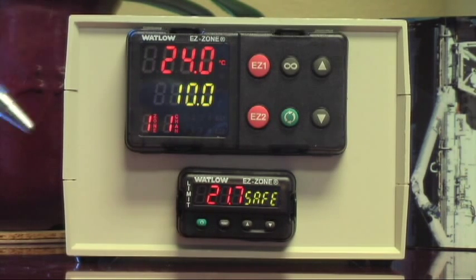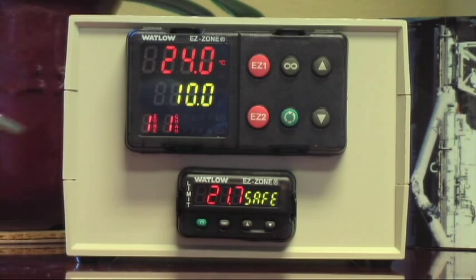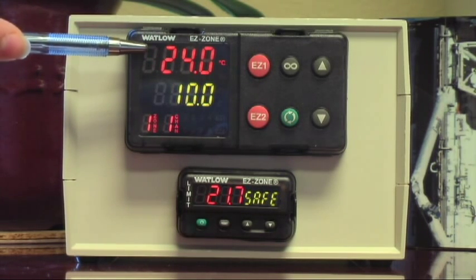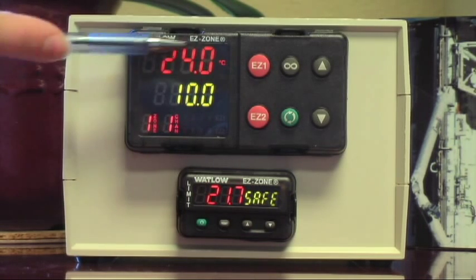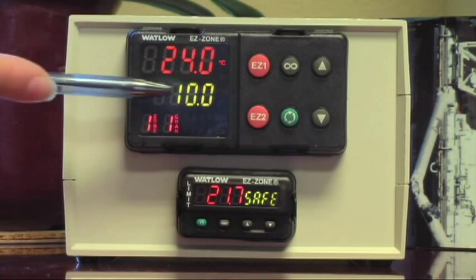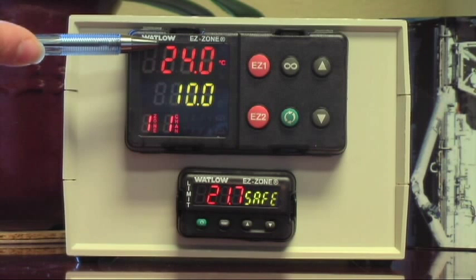100 degrees C, yes please. So the controller comes from the factory configured in C, and all you really need to know are a couple of things. The first one is this 24 degrees is the temperature inside the oven right now — that's your application temperature. As your oven gets hotter, that's going to go up. This green one is the temperature set point, so this display is only going to change when you change the value. This one will change as the oven's heating or if you open the door.